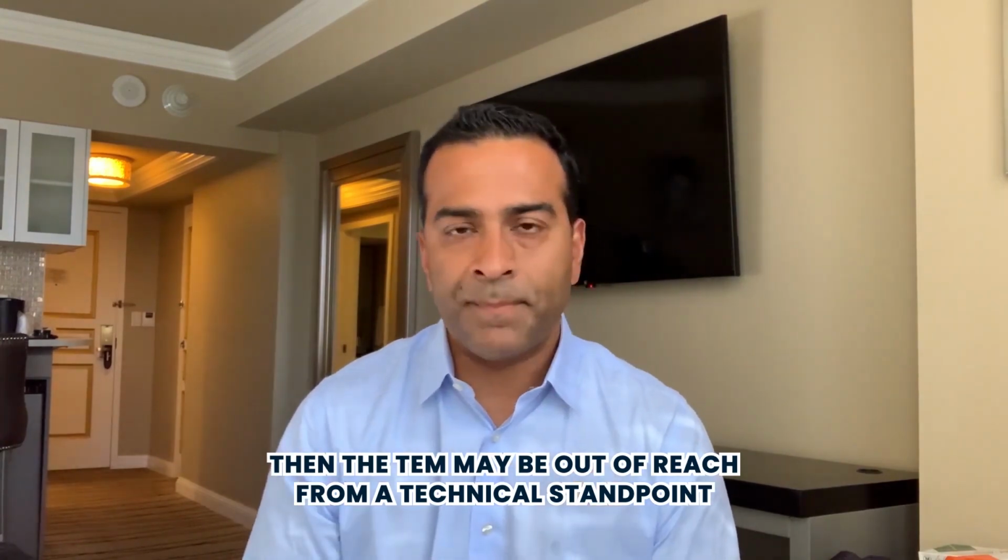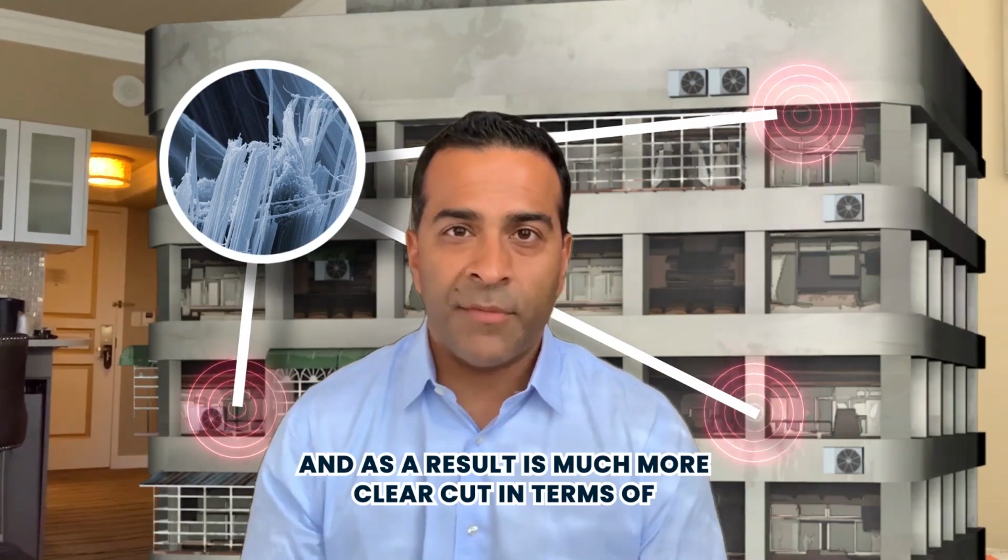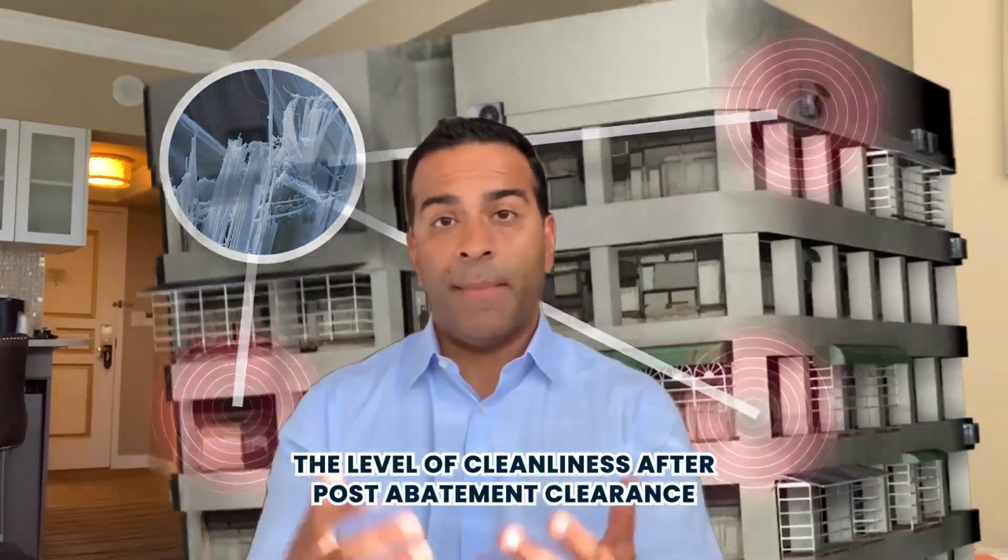From a technical standpoint, the TEM air sample identifies asbestos fibers exactly, and as a result is much more clear-cut in terms of the level of cleanliness after post-abatement clearance.